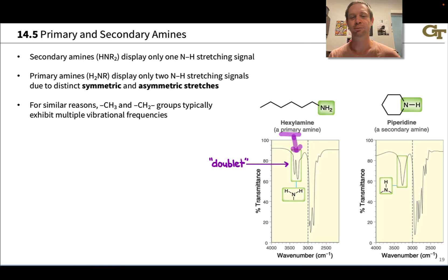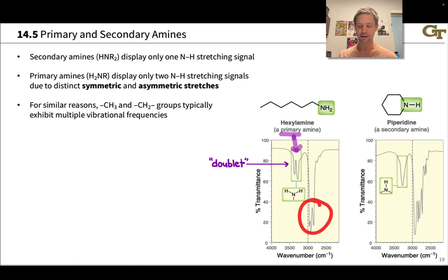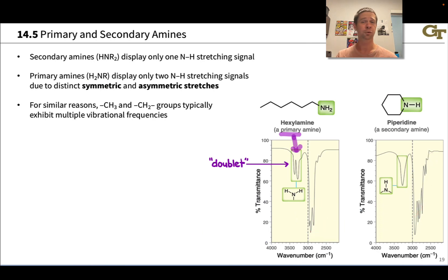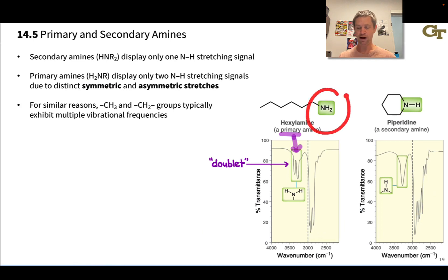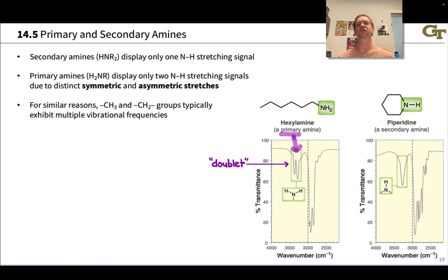This is about the only time you'll hear the term doublet used in an infrared context. For similar reasons, CH₃ and CH₂ groups display a variety of frequencies and a variety of peaks — that's why you tend to see a cluster of peaks just below 3000 wavenumbers where C-H bonds are vibrating in different ways. The doublet is a nice diagnostic way to tell the difference between a primary amine and a secondary amine, which will have only one N-H stretching signal.